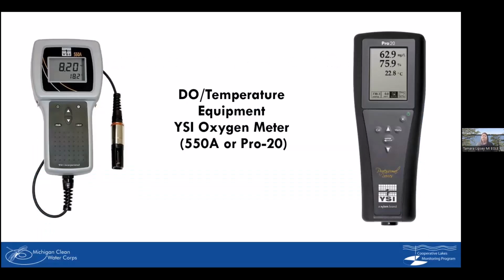We have two types of monitors that you might get. We have a few of the older model, which is the YSI 550A, which is here on the left. They still work great, and we want more people to be able to participate. So we do have some of these meters still available, but the majority of our meters are this other model called the Pro 20.